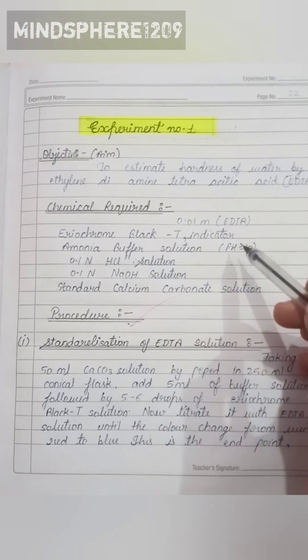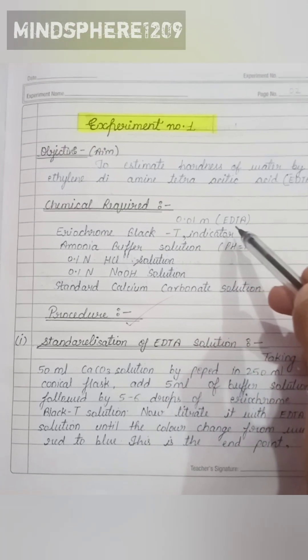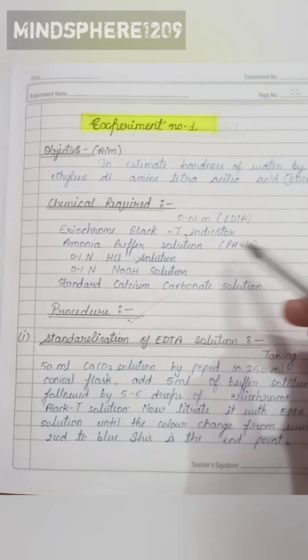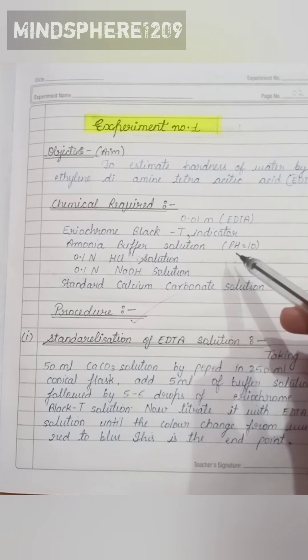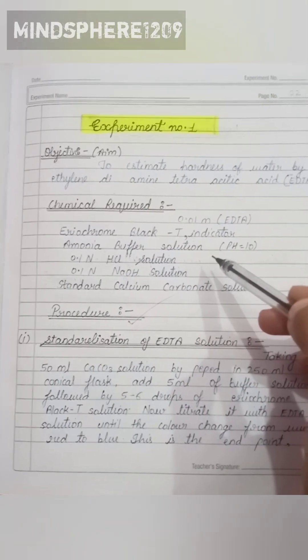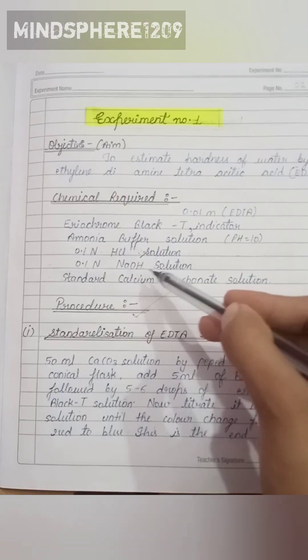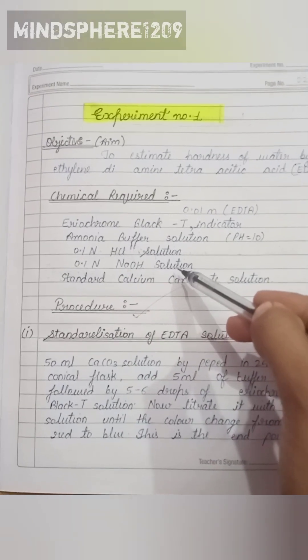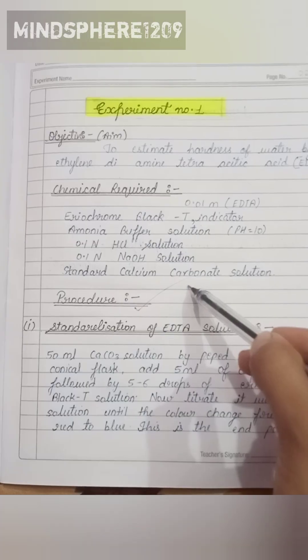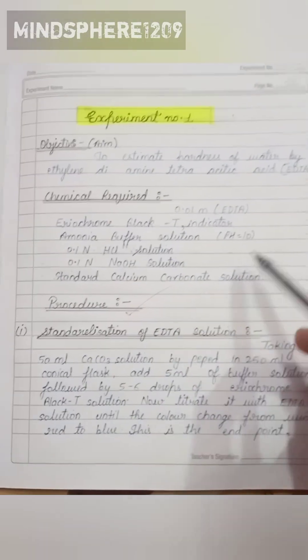The chemicals required in this experiment are: 0.01 molar solution of EDTA, Eriochrome Black T as an indicator, ammonia buffer solution whose pH is 10, 0.1 N hydrochloric acid, 0.1 N sodium hydroxide solution, and standard calcium carbonate solution.